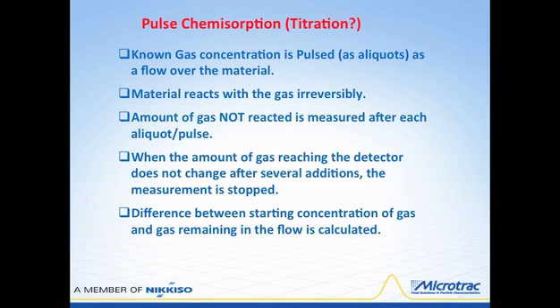And as you would add a small amount of the acid to start the titration, some effect would be observed, either a drop in pH, or if you're using a color indicator, you may see a color change depending on the type of indicator dye that's used. But there would be some type of response.